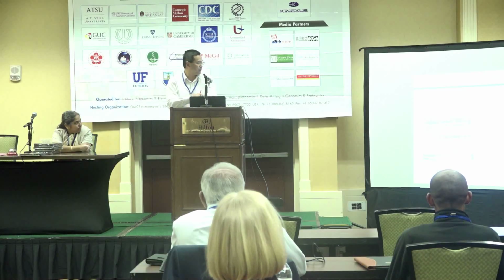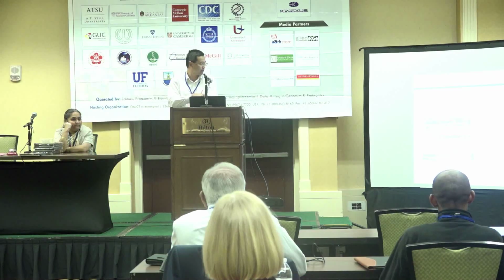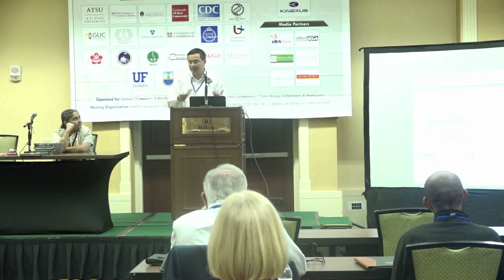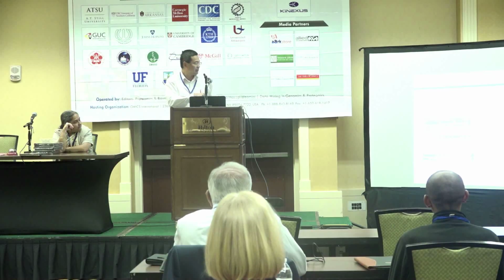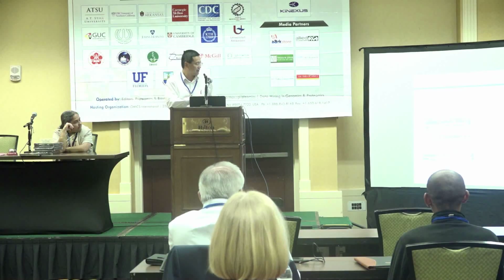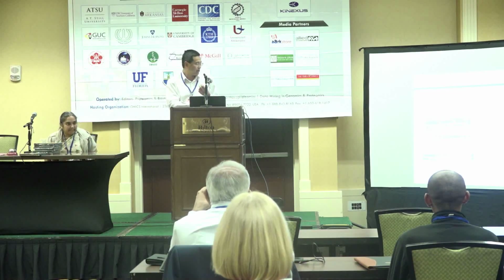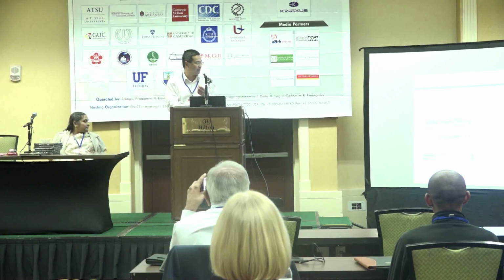And also, especially for people working with serum, the human proteome, biomarker discovery using body fluids like urine and serum, they're really good samples. But the problem with serum is you have a lot of abundant proteins and the dynamic range is so high. In the lab, we actually use several approaches. One is antibody-based depletion. You can deplete the 20 most abundant proteins, then you start to see low abundant proteins.